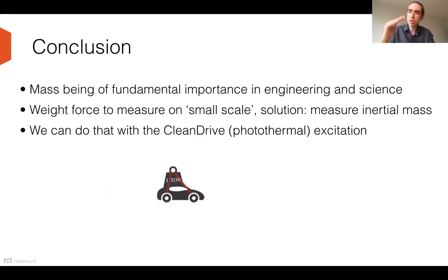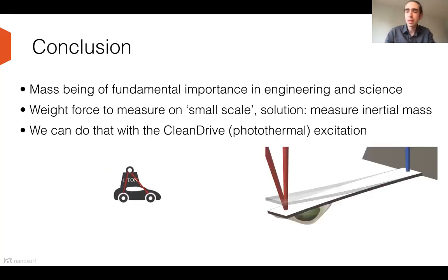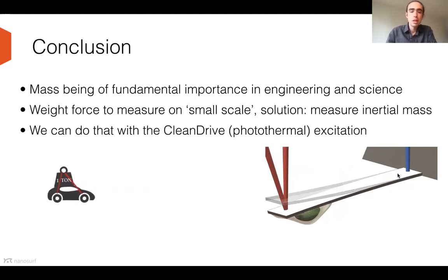Now, the question is, how do we excite these cantilevers? How do we make them move? How do we make them oscillate? This we do with the cleanDrive, which is a photothermal excitation. So you have two lasers in play, one for the readout, which is a standard thing, but you have an additional laser at the base, and this introduces the movement via a thermal heating cycle.